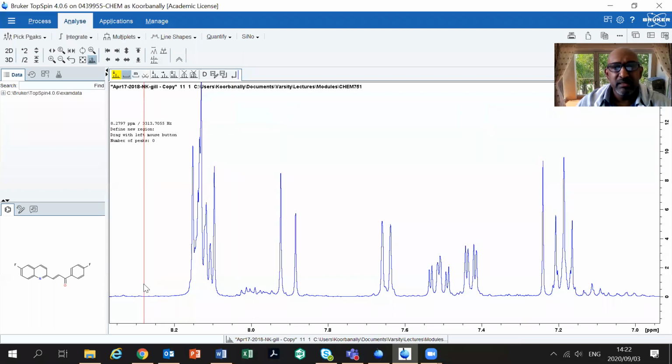So you have something that's a spectrum like this, and now you want to start picking your peaks, all right? In order to pick your peaks, you need to use your mouse, click down, and create a square over that particular peak that you want, right? Once you create a square over that particular peak, it will give you a value. And that value that you're seeing here is for that particular peak, right? So if I want to look at that particular doublet, this first part is that value, the second part is that value.